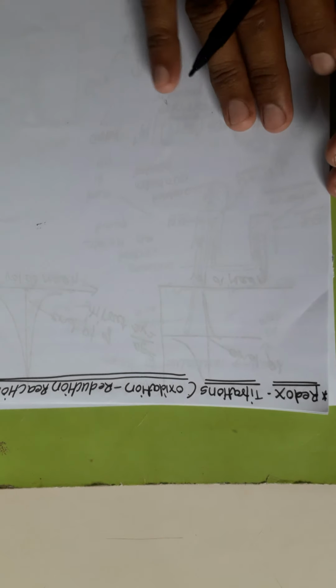What is meant by redox titration? Redox titration means an oxidation-reduction reaction: a titration in which an oxidation and reduction reaction is carried out is called a redox titration. See how to carry out the redox titration.